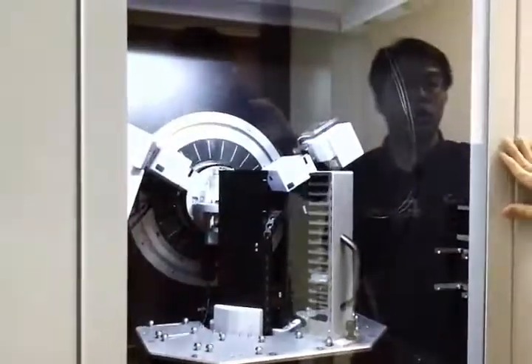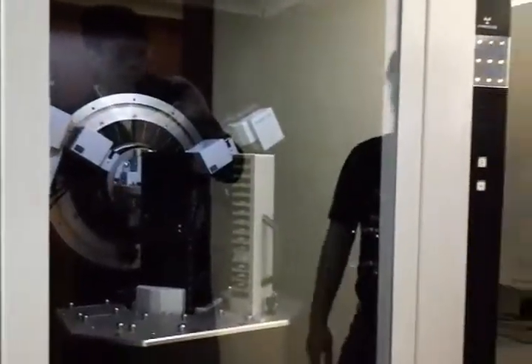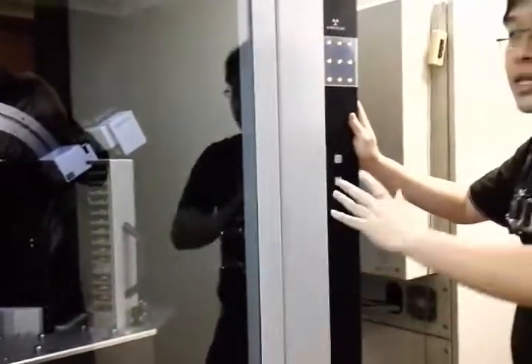I forgot to mention that the tube is cooled by a water chiller outside. The water chiller is a new one — it's a two-pump chain between the two systems. The principle is still the same: it cools down the X-ray system. The water chiller is very important.